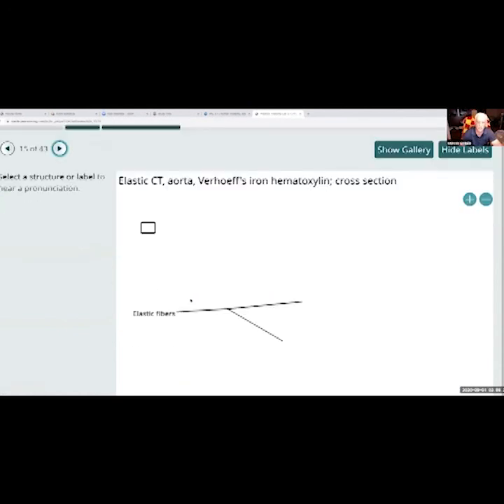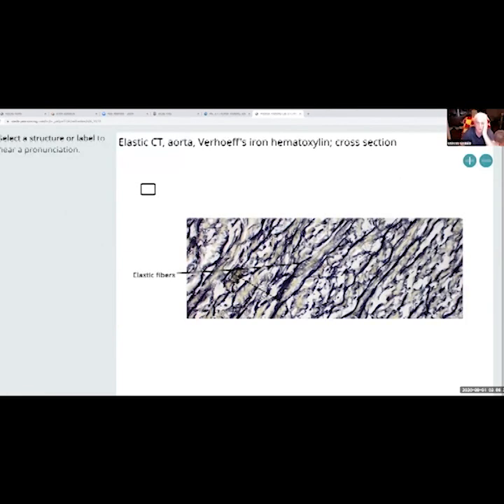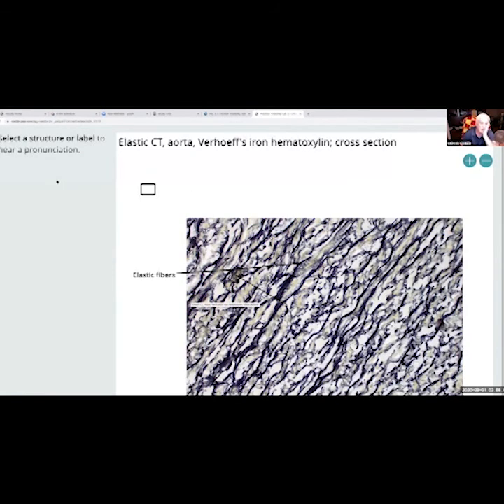You don't want the aorta to rupture. Again, the elastic fiber is kind of more blown up. You can see all like squiggly structures in here. And they just allow this organ or this structure to expand. And we'll go over the heart and go over all that. We do the heart. I think we have two or three sections on the heart.